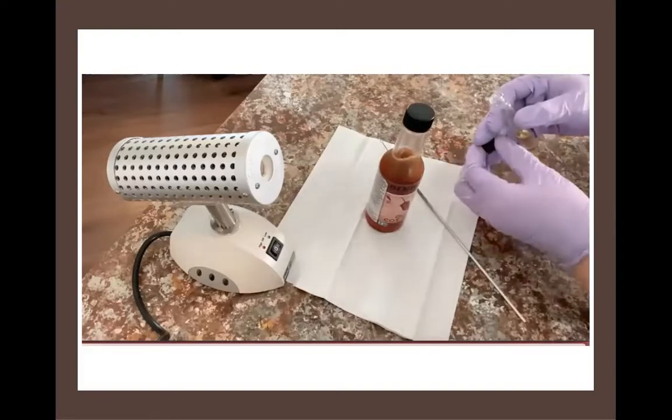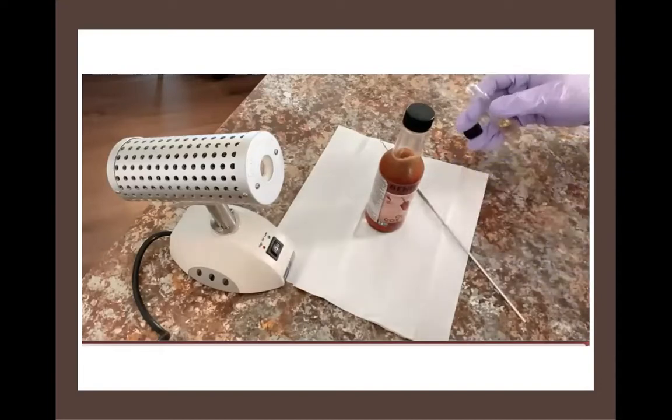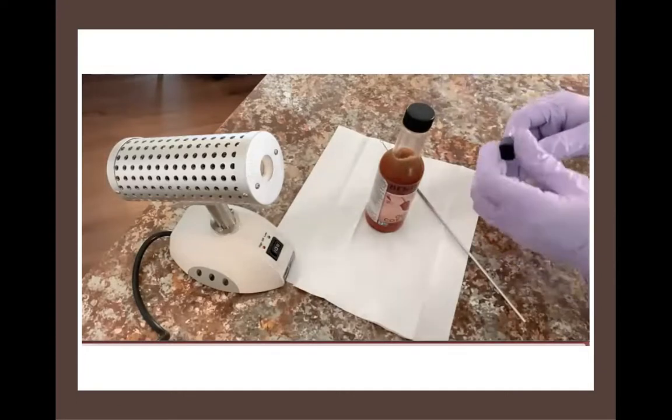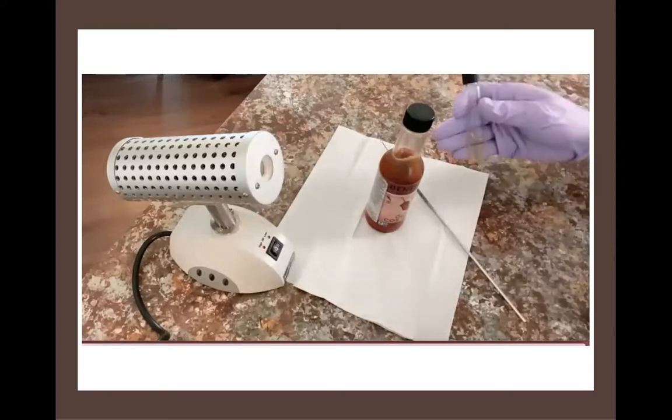Now, after I'm finished doing whatever it is I'm going to do with the tube, I'm going to pass it through again before I put the cap back on. Again, if I have accidentally introduced any microbes during my procedure, I just killed them. And I've created a little current of air right at the end, just in case there were any microbes hovering over that opening. I've killed them with that heat.